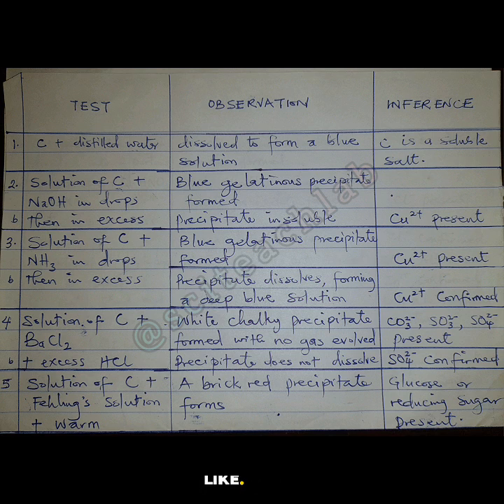You may not be asked to test for Cu2+, SO4 2-, and the glucose or reducing sugar. You may not be asked to test all three. You may be asked to test two, maybe Cu2+ and SO4 2-, or Cu2+ and glucose. But whatever you'll be asked, I've got you covered, and I've provided everything you need to get the answer that is required.